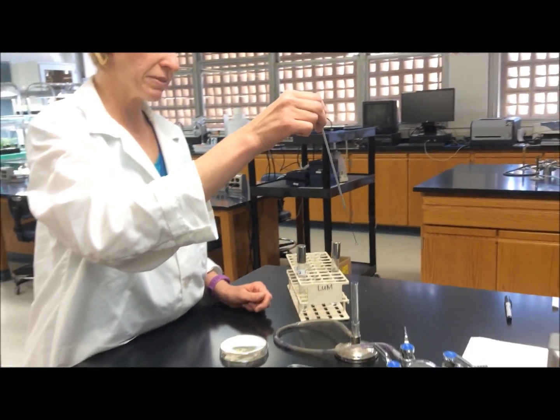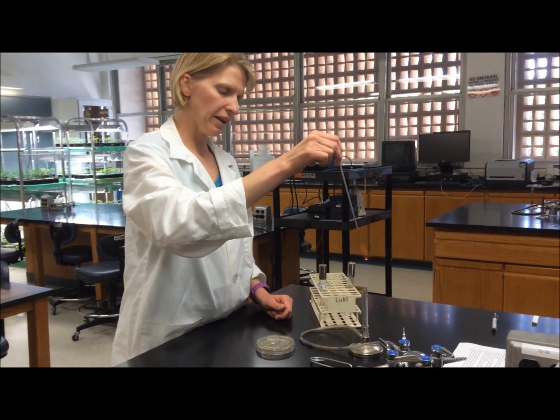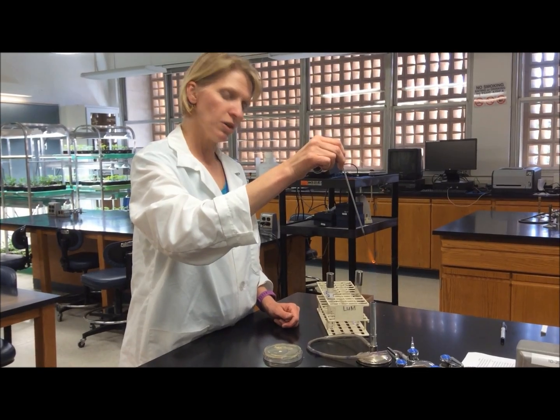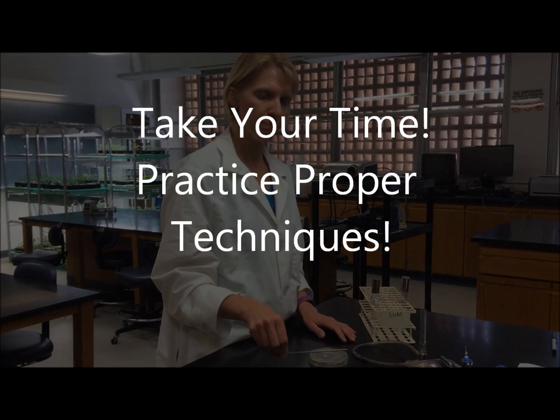Of course, when you're done working with your culture, you simply flame your loop and get it red hot to sterilize it before you set it down on the bench. And that is how you prepare a liquid culture.